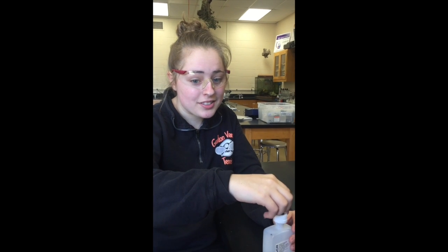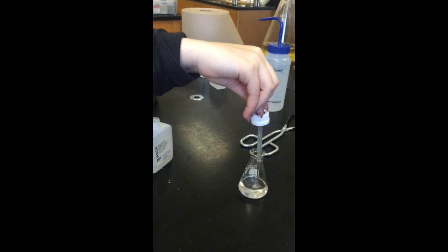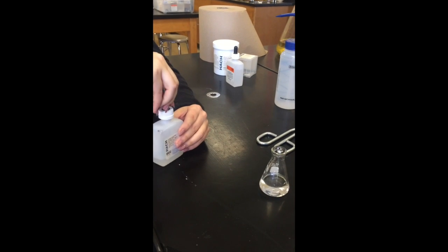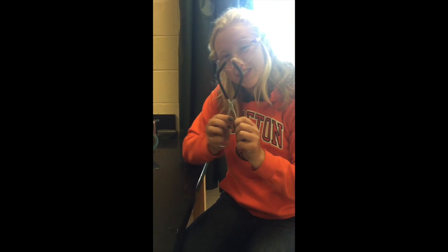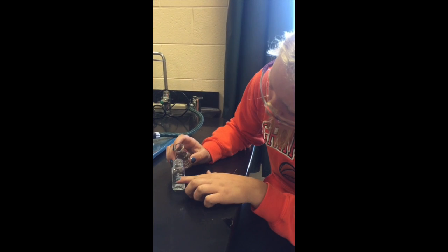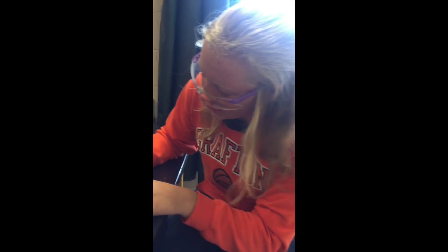Add two milliliters of sodium hydroxide solution by twice filling the dropper to the one milliliter mark. When transferring the liquid from the Erlenmeyer flask to the sample bottle, you can use tongs or you can use your hands, making sure that it's at least up to the 20 milliliter mark. If not, add distilled water to make sure that it is full.